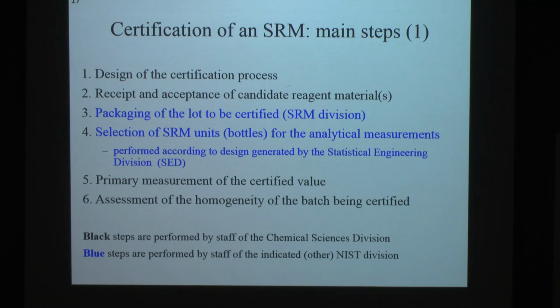But if you have 14,000 bottles, bottle 1 and bottle 358 and 10,392 and 14,800, how different are they? What kind of scatter do you see? That has to be taken into account, because the buyer is going to get bottle 3,906 or 7,235. What's the probability that they're going to be how far off the average value, if you will, that is being measured?